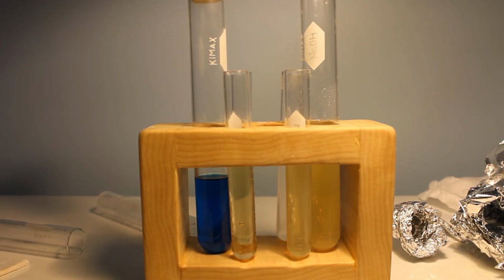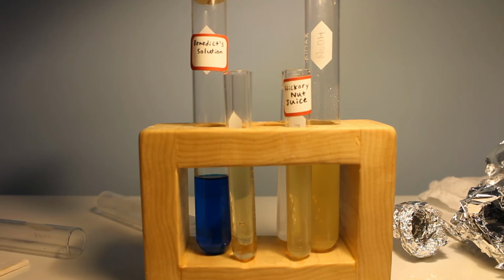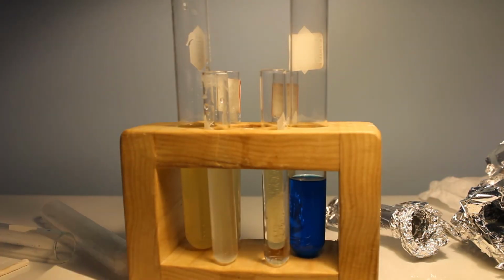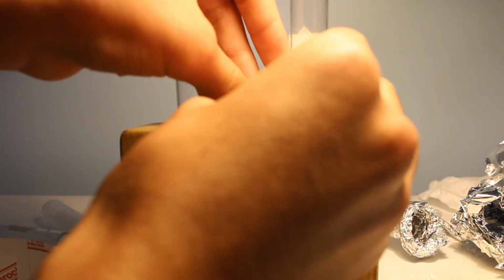If we're going to do this right, we need labels. Let me get the labels. Okay, first up, Benedict solution. Next, hickory nut juice. Next, cane sugar. Next, stevia. And last but not least, tap water. Now we're ready for testing.